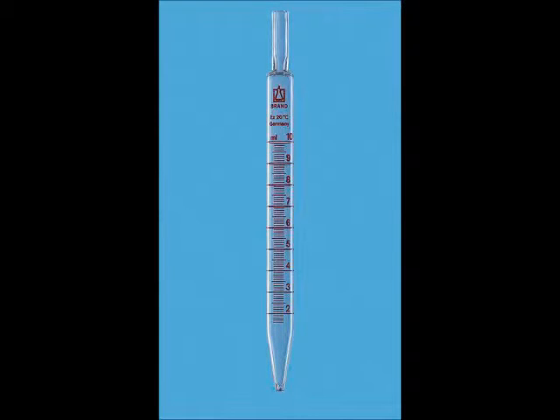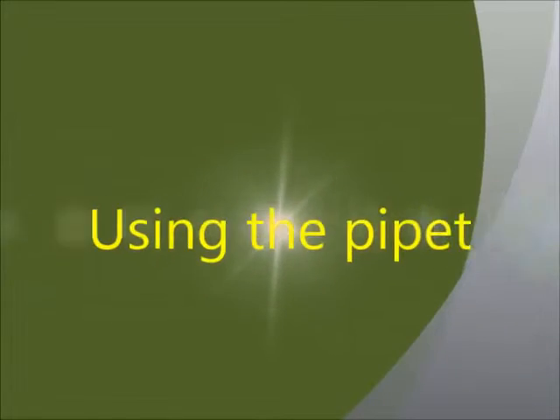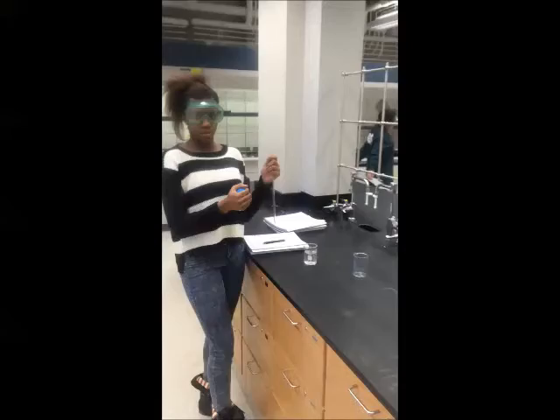Now that we have gone over all formulas and definitions, it is time to start the lab. A quick tip to remember is to rinse and clean the pipette before using it. You rinse with water and solution 3 times. The water rinses it out, and the solution will rinse out any leftover water that would have any dilution effect.